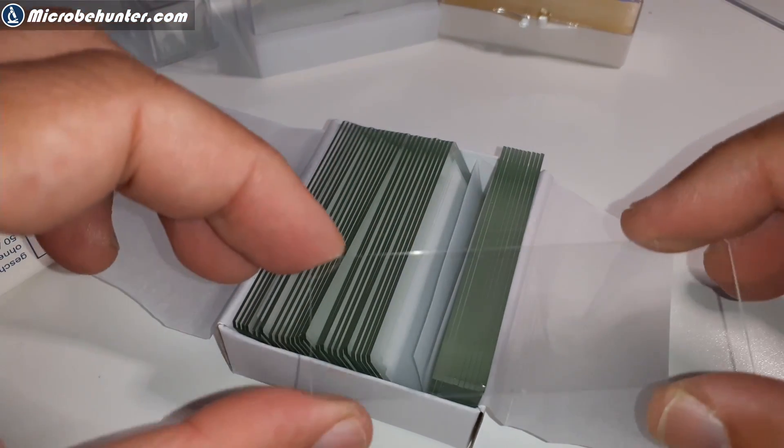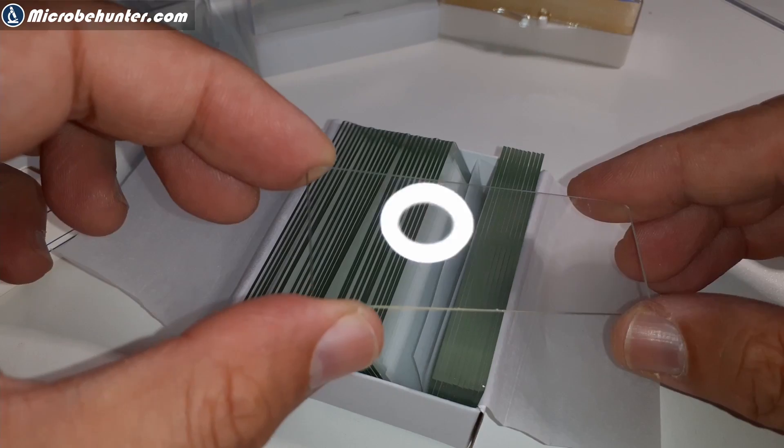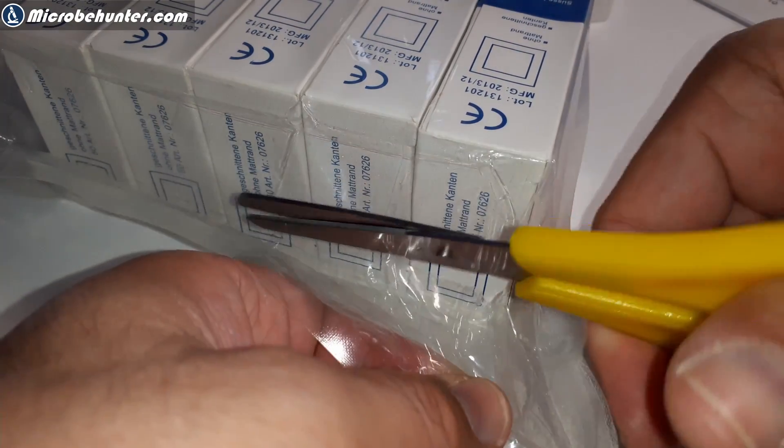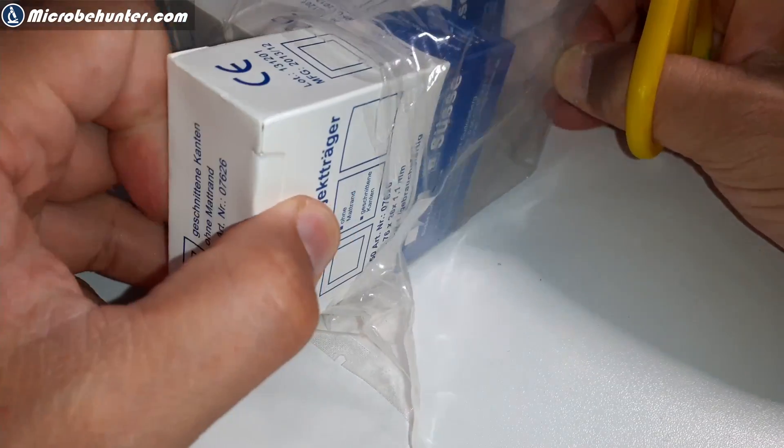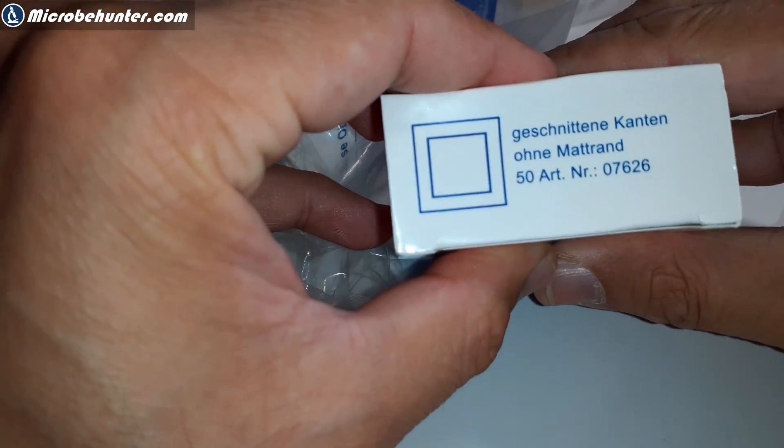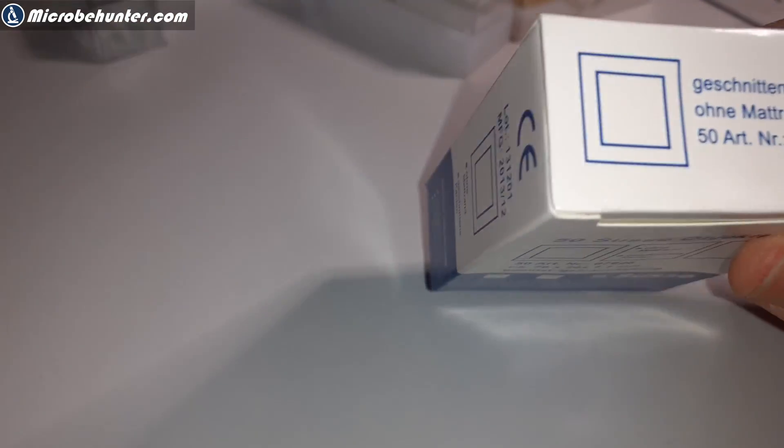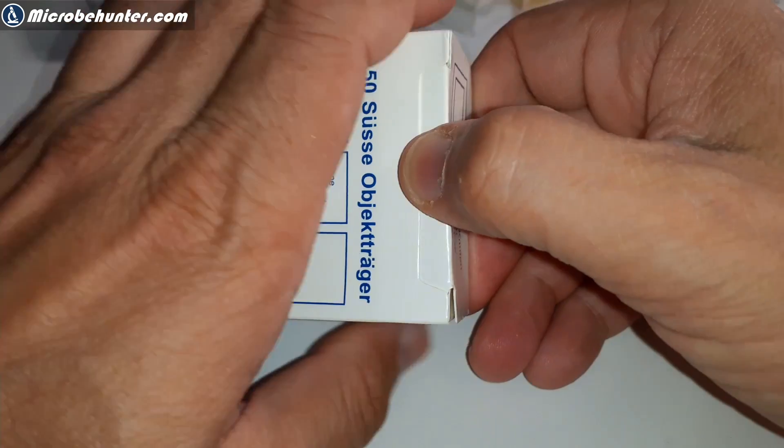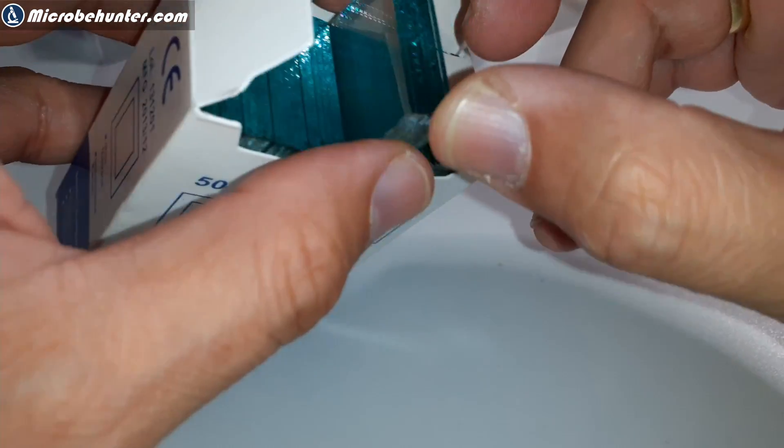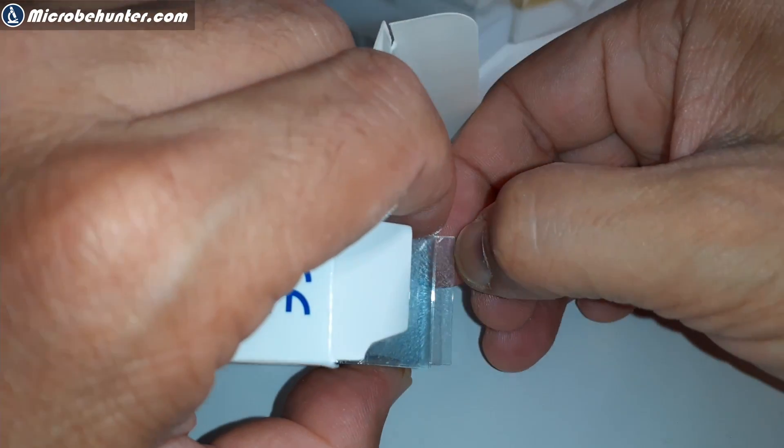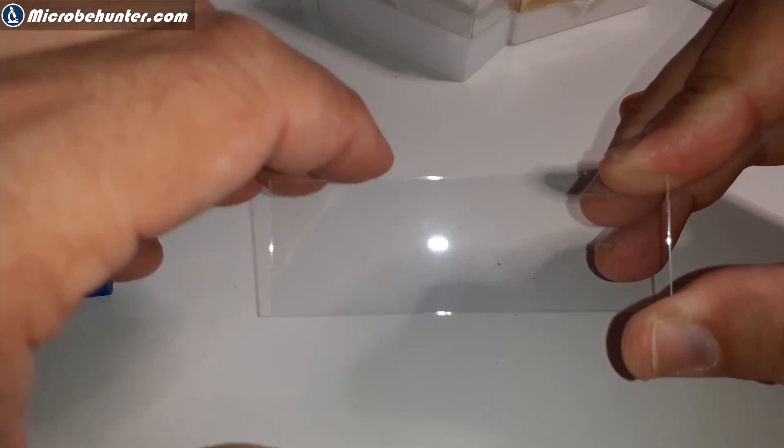Generally, I will reuse those slides. I will clean them and wash them. When they come out of the box, the reflection of the lamp shows that the slide is pretty clean and usable as it is. Now let's open up the other pack here. These are quite low-cost economical slides. They're disposable. I sometimes also wash them, but actually they're so cheap that you might simply throw them away. The labeling is in German here—it says cut edges without frosting. Different companies and brands manufacture all sorts of different slides with different types of features.